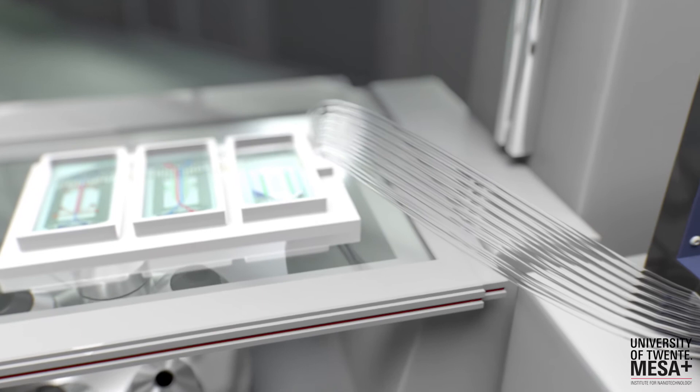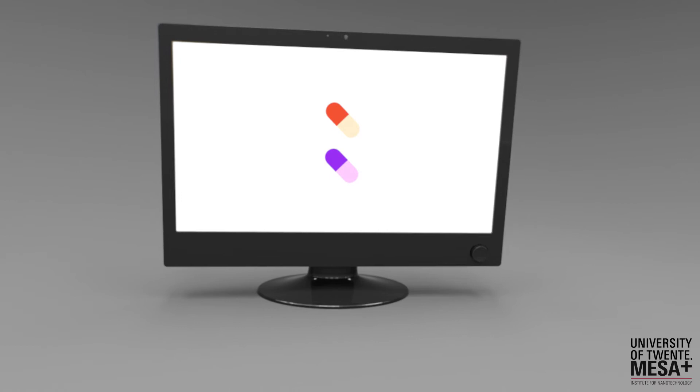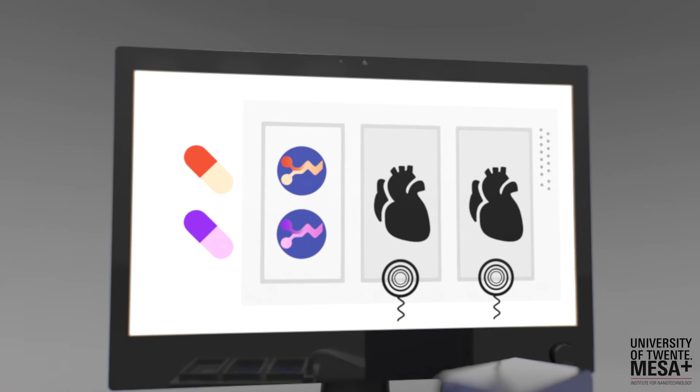Let's take a look at an example. If we would like to study the effect of a certain mixture of drugs on the heart, we insert a mixing device and two heart-on-chip devices with integrated force sensors. In the software, we select the two chips, and for each chip, we define a different mixing protocol. Automatically, the correct mixture is routed at the right time to the right model.